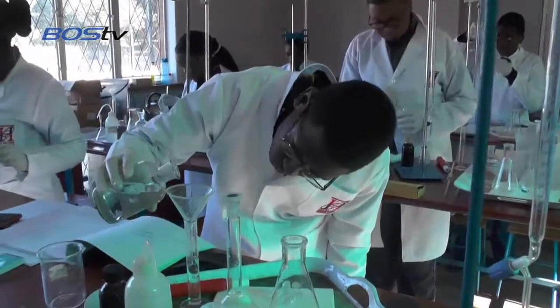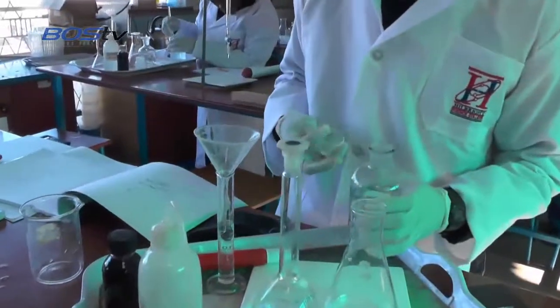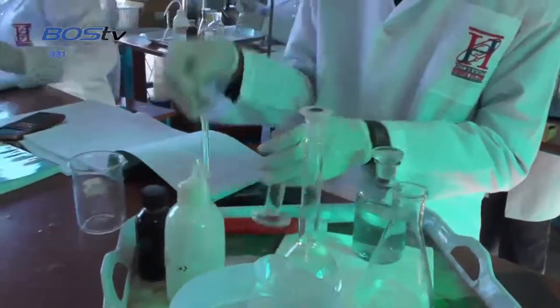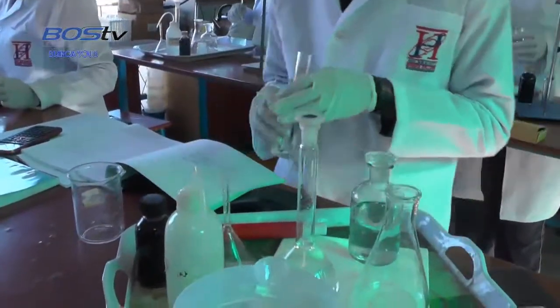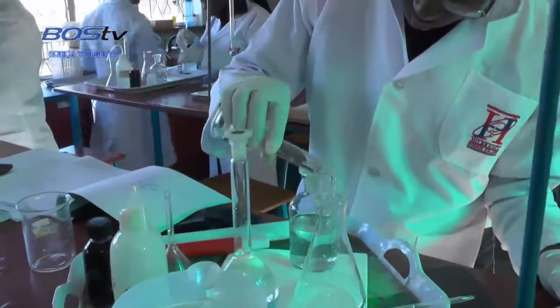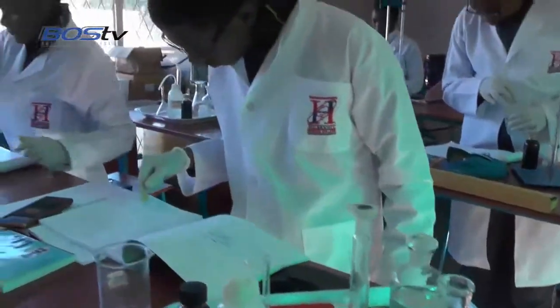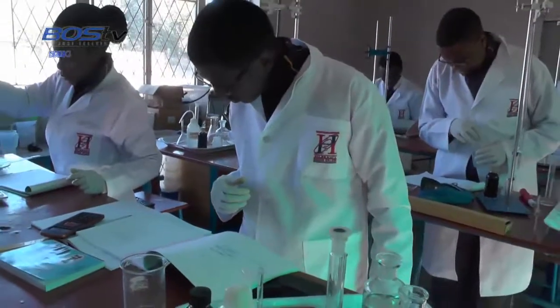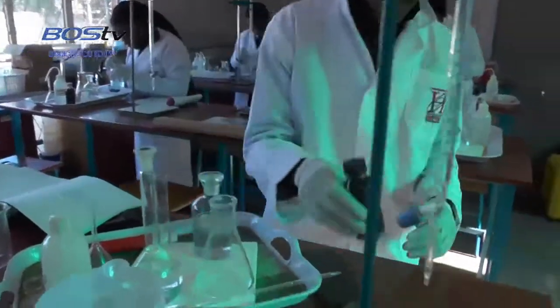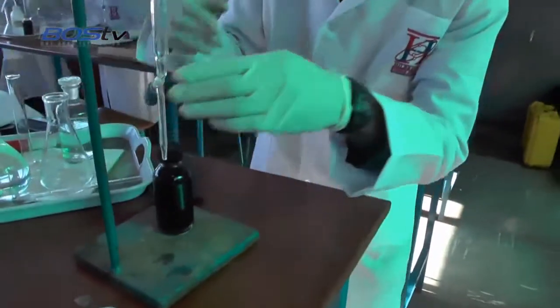Then start the titration as instructed. Don't overshoot the mark in your volumetric flask.